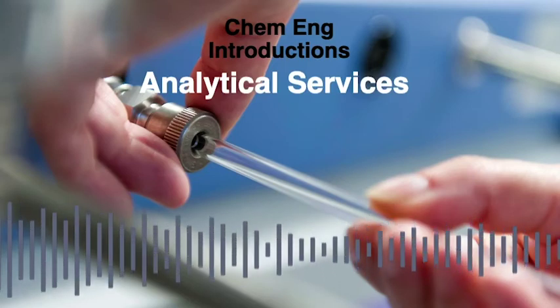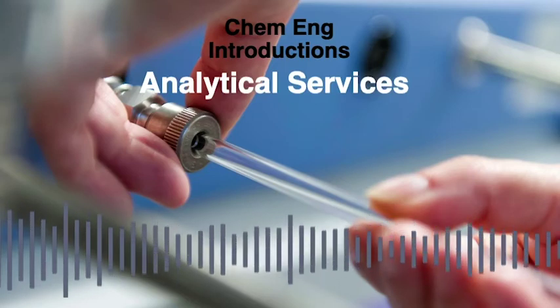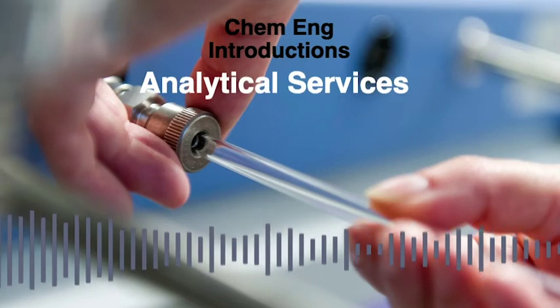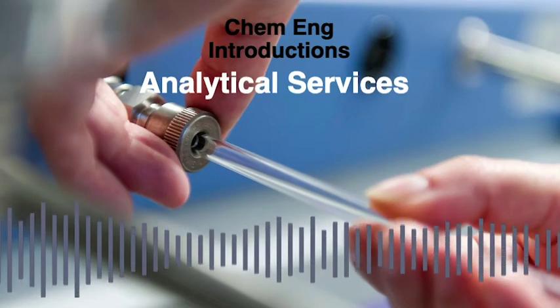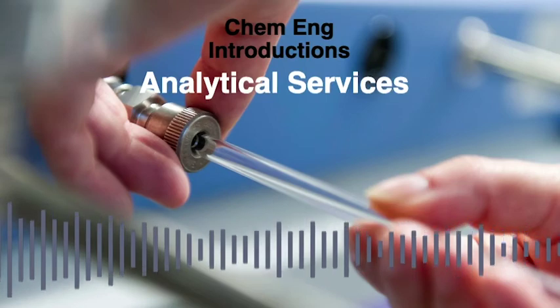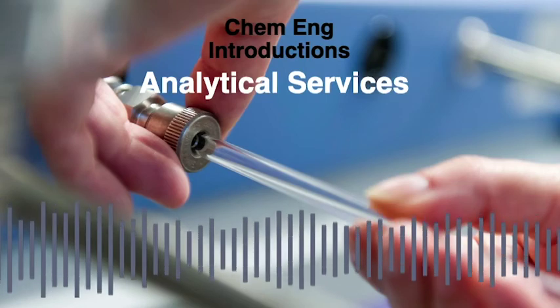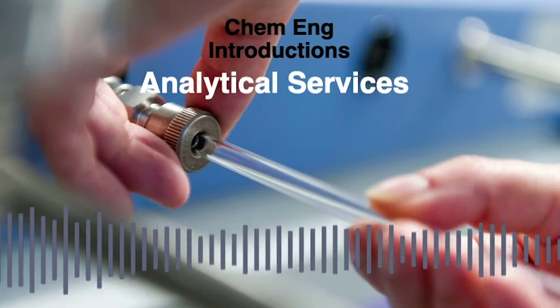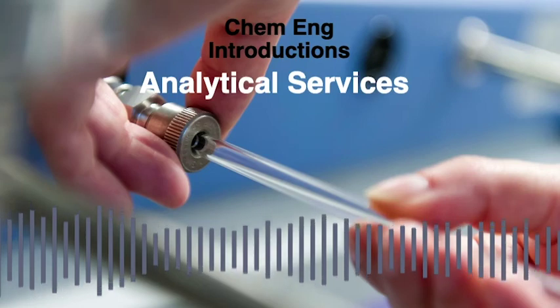Basically, I'm working on BET, so it's a method for measuring the surface area and the pore size of material. My material in particular is a porous polymer, and it's used for gas absorption, so like pollutants and that kind of thing. Yeah, I mainly work on BET, some DSC and XRD are my main ones that I've used in here. But my group generally are down here a lot.